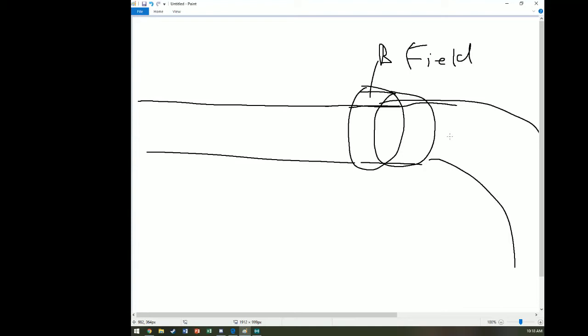So here, let's say I had a proton come in here. The B field will exert a downward force, and you get the proton being displaced, going down the curve, and now its trajectory is changed. For those that take physics, this might be helpful. This is actually a centripetal force, and as a result we can write that qvB equals mv squared over r.